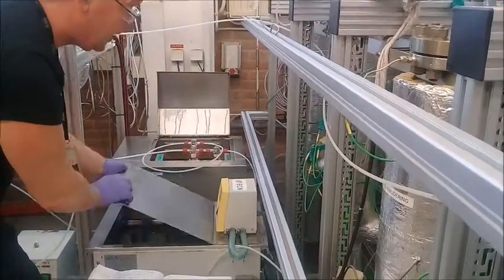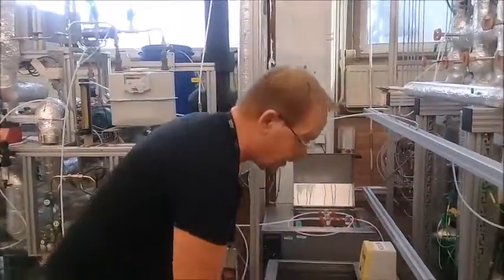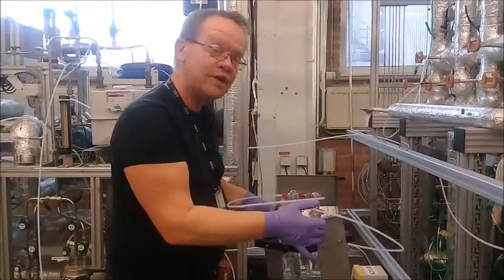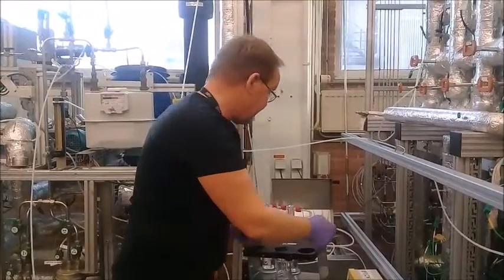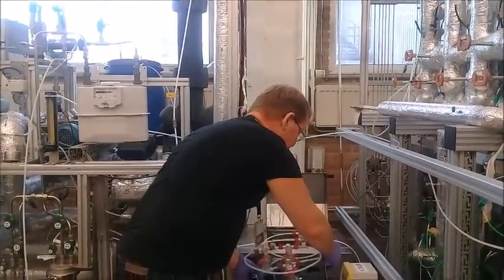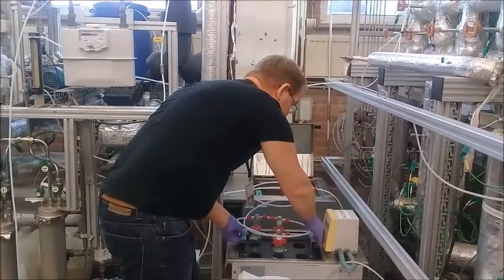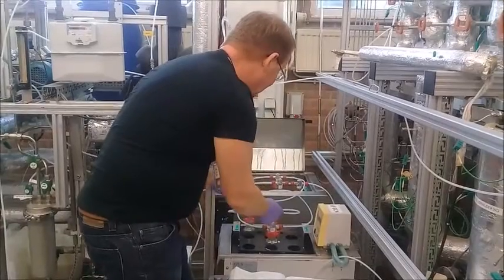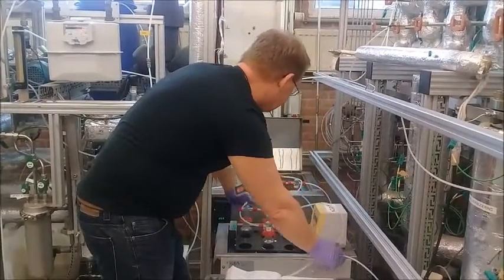We then move to the cooling bath, in which we will place the second washing bottle rack. The second rack also contains 3 washing bottles, which will be placed in the cooling bath at -20 degrees. Just put it in slowly in order to prevent thermal shock in the washing bottles. There they are. And we can connect the other lines to it.